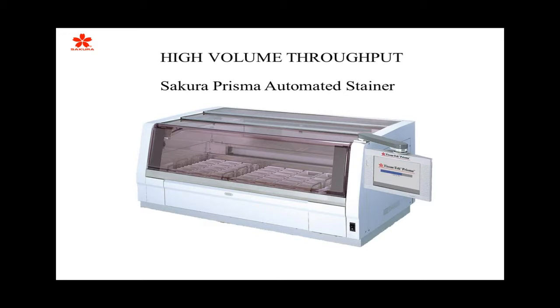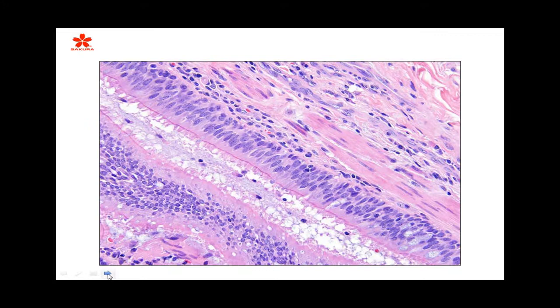So this was basically the last slide that I wanted to show, with the exception of one more ending slide, which is considered an optimal stain. And this is what I would consider optimal, but you might say it's too light or too dark. I would challenge everyone in the audience now to go back, since we've talked about how to take a critical look at your stain, to those that you graded in the beginning, and you can do this on your own, and see if you would give it the same grade that you gave it before.